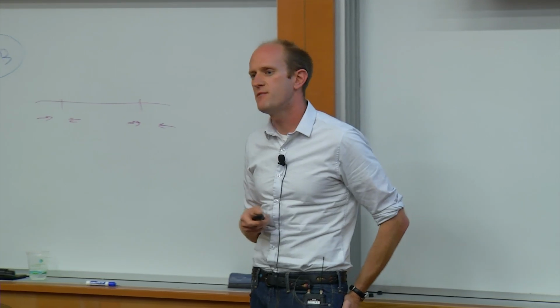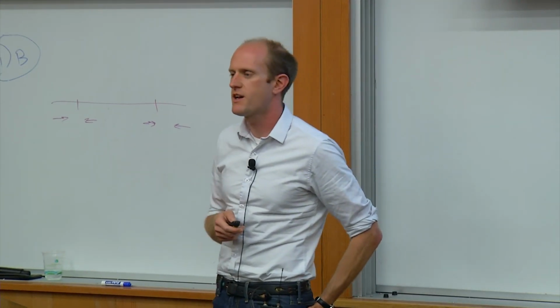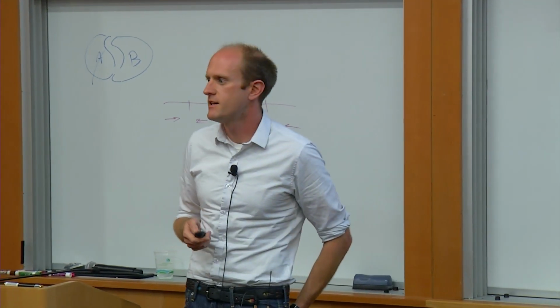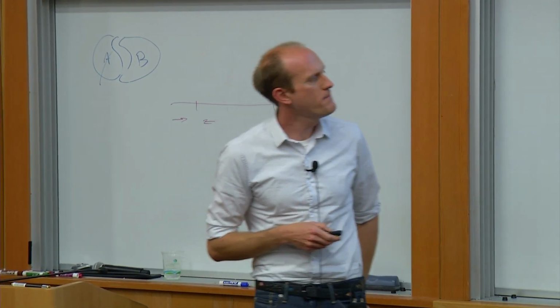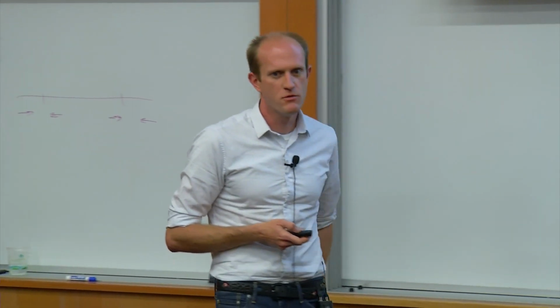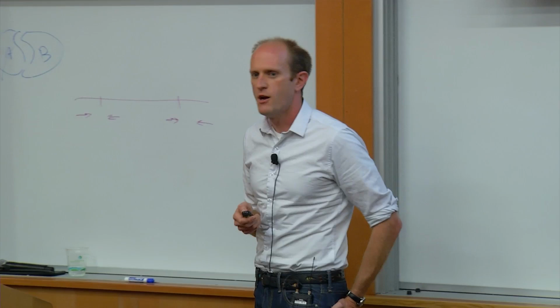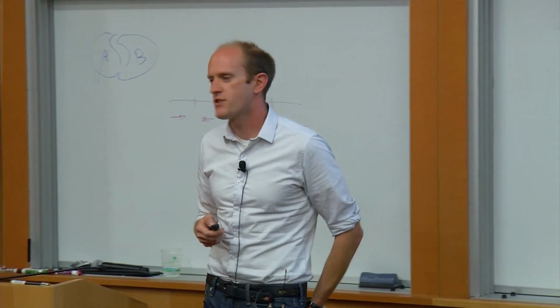I could have also said, give me an HDR template that will only work with the guide that you're paired with. I could have also said, give me one that's compatible with 5 guides, et cetera. Okay? So this is really up to you. This is something where, like I said, we're working on turning this into a web tool. And hopefully sometime soon, we'll be able to share it with you.